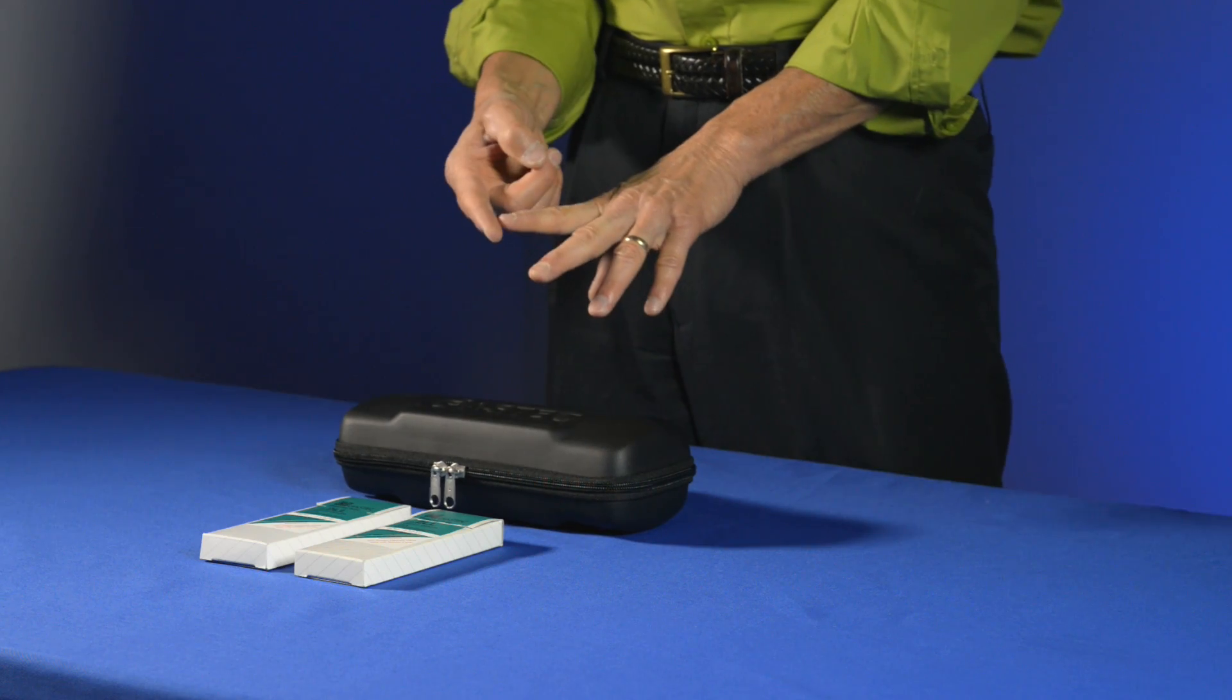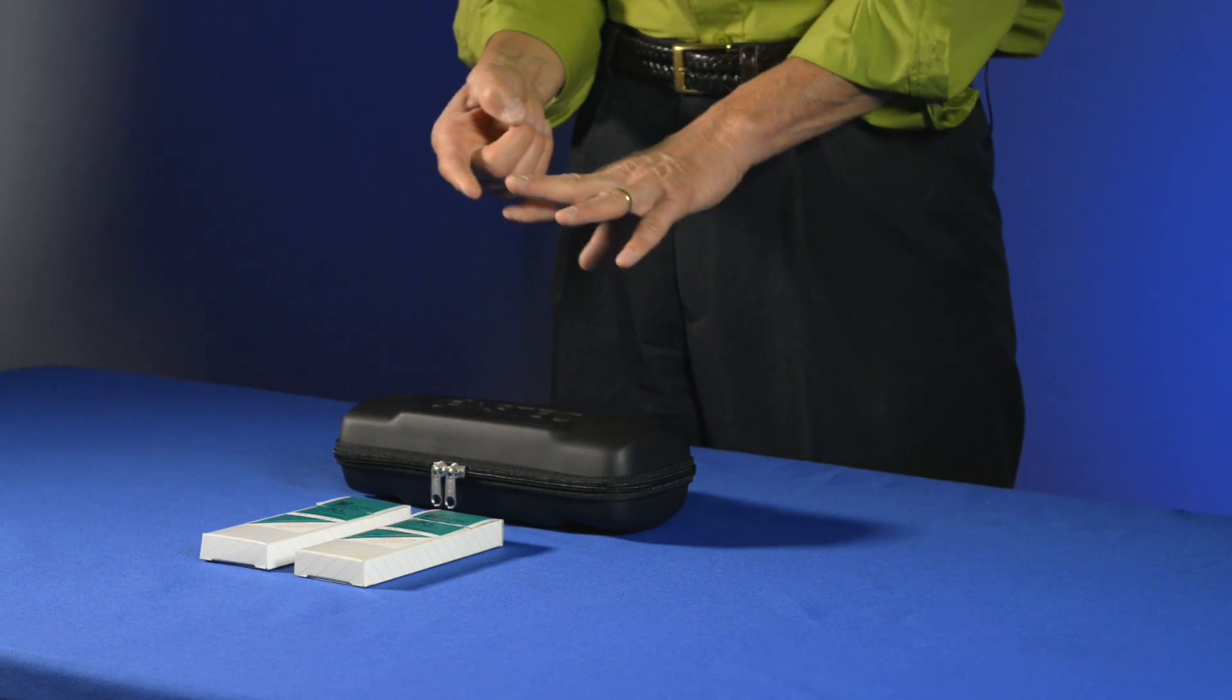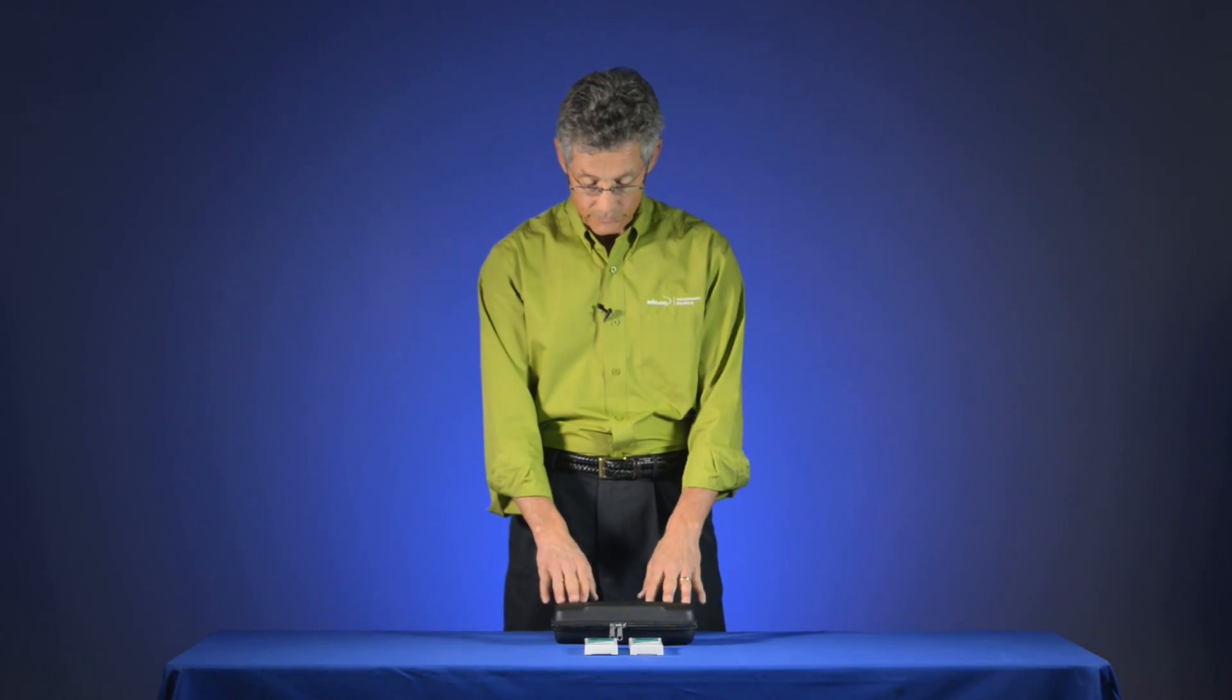The tubes are used because they are intrinsically safe by design, they are pre-calibrated, they are inexpensive to use, they are available for a multitude of gases that are hard to measure otherwise, and it's a very simple device.